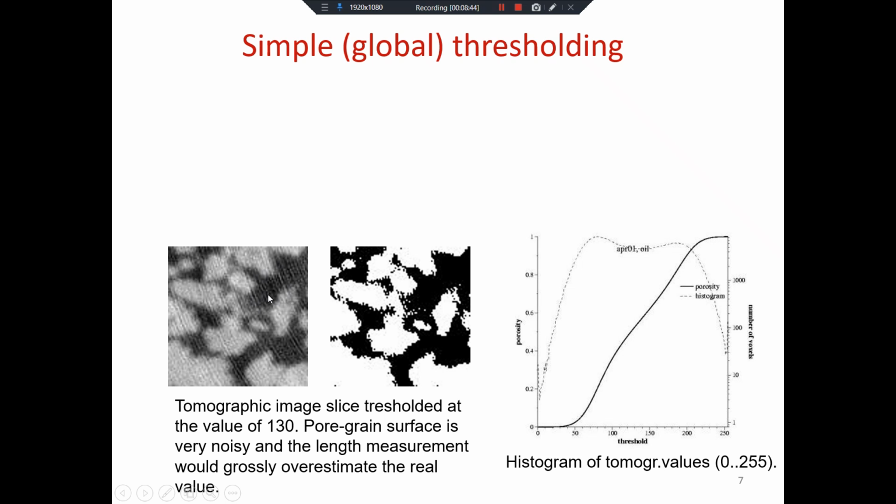This is oil phase, by the way. And the other one is polyethylene. It's about 50% porous. So about 50%, so I have decent amount of both. It's just that they overlap so much because of noise. I have inside polyethylene these dark pixels that shouldn't be dark. They're there because of noise. Right? So that then results in this overlap.